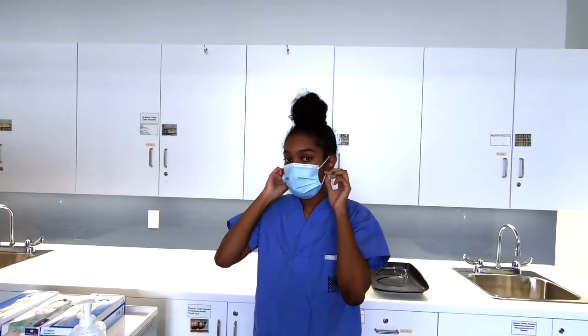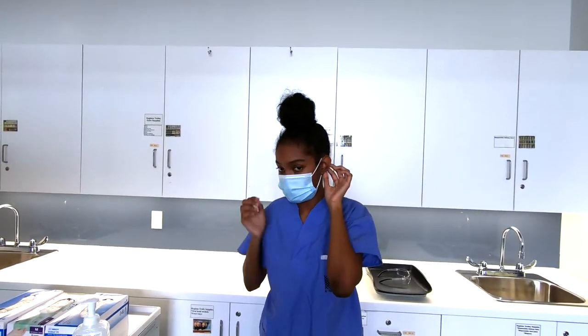For the mask, grab it by the loops, ensuring it falls away from your face, and do not touch the front of the mask.